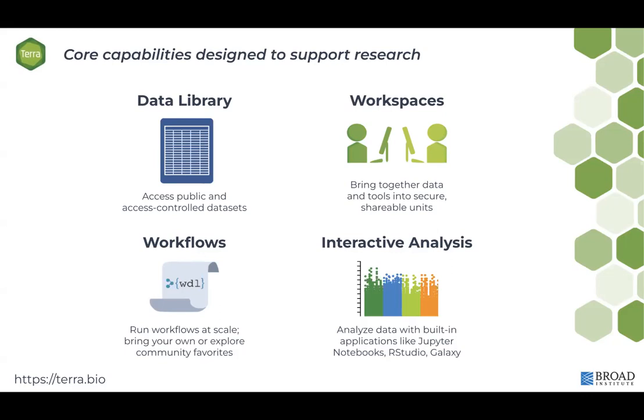And we have interactive analysis, which is a way of taking your downstream results and visualizing them and doing all sorts of things. And we'll demonstrate both workflows and interactive analyses during this workshop. Today, we're actually going to start with interactive analyses, and tomorrow we'll show you some simple workflows.